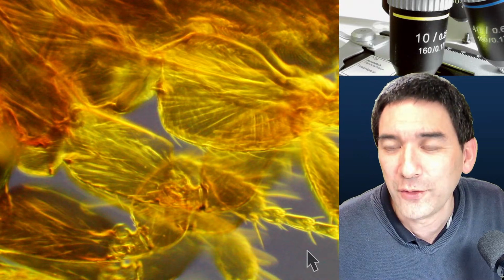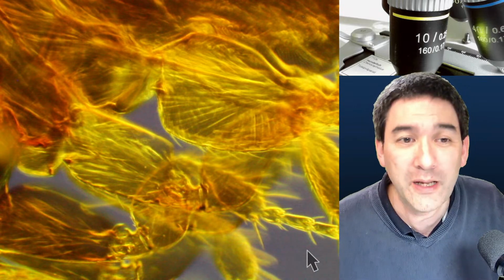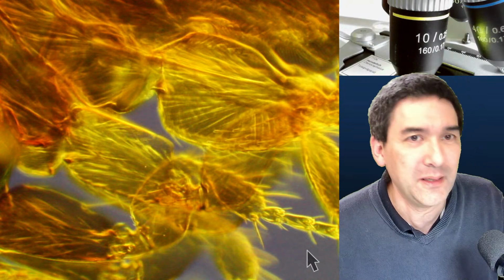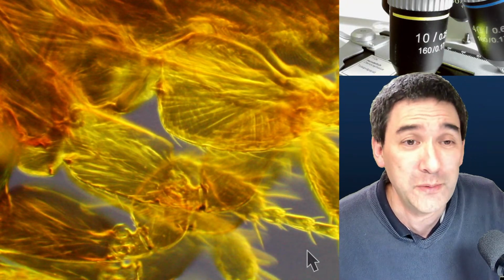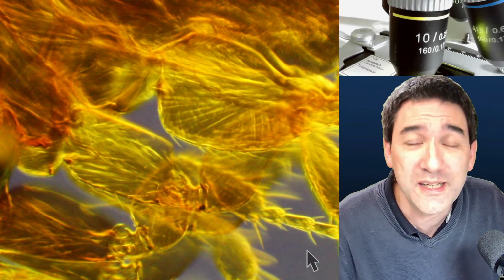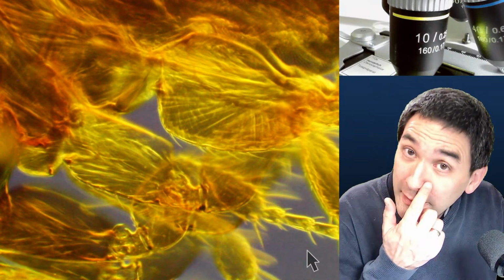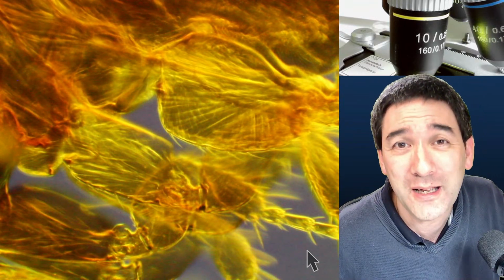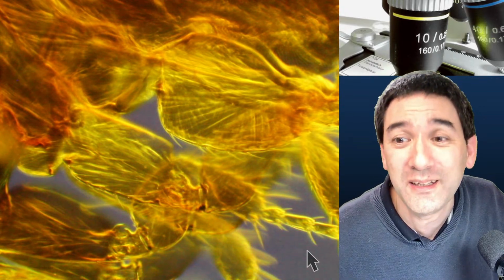With the wide variety of filters, how do you keep track of the most effective filters, or do you have a notebook or good memory? I don't have a good memory, unfortunately. I'm a little bit disorganized concerning this. I just like to do a little microscopy and experiment around, exchange filters and try different settings. However, I did once keep a notebook, and I do recommend that. Some kind of lab notebook sounds very fancy, but actually it's some kind of diary where you simply write down your notes so that you do not keep on reinventing the wheel.